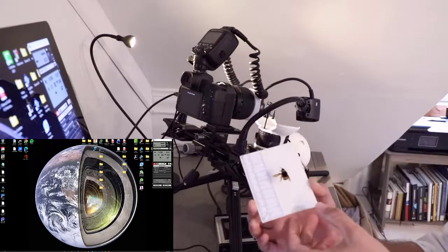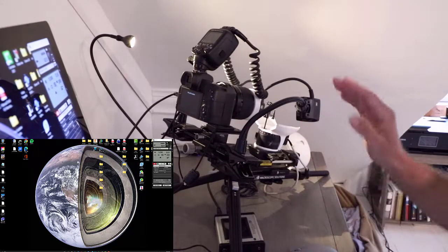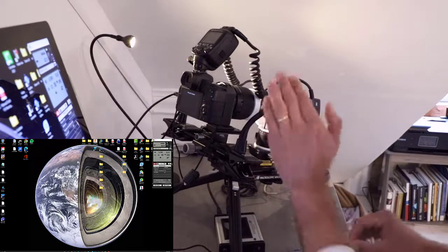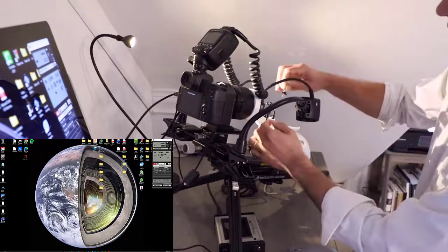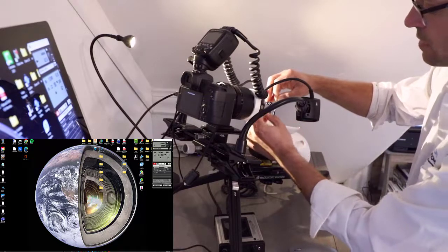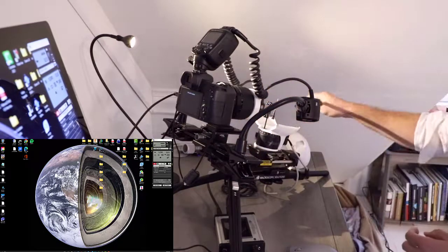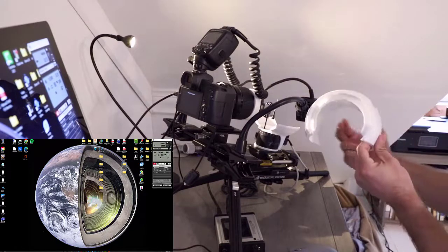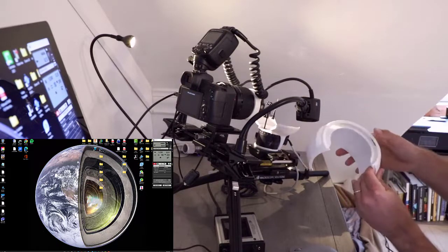We're going to be working with the MPE 65mm lens, somewhere between a 1 to 3x range. Just to give you a little bit of an overview on the system I'm going to be using. We're using the EOS R mirrorless camera, the MT26EX flash. We have the universal stage here to give us a little bit of flexibility when we're moving and manipulating this specimen. And then we have a light dome, which we place over the rotational stage, which is designed to block any direct light, but also bounce light around internally so that we're getting the specimen well illuminated from all angles.